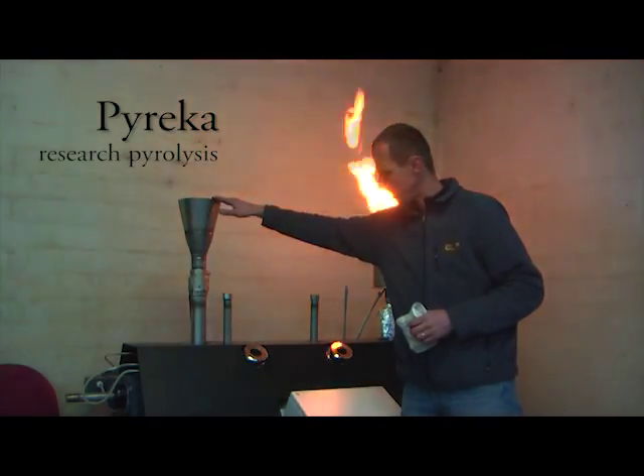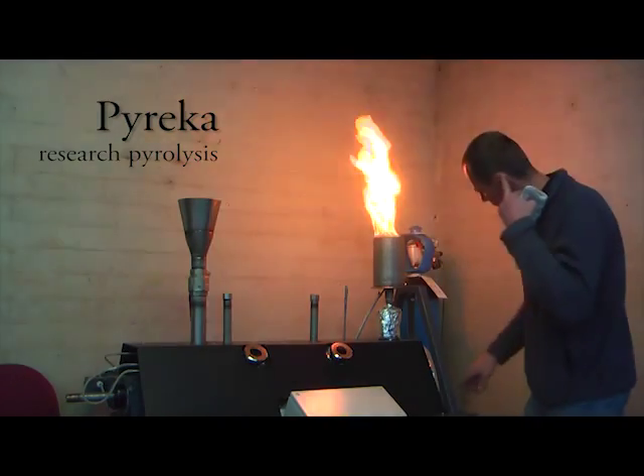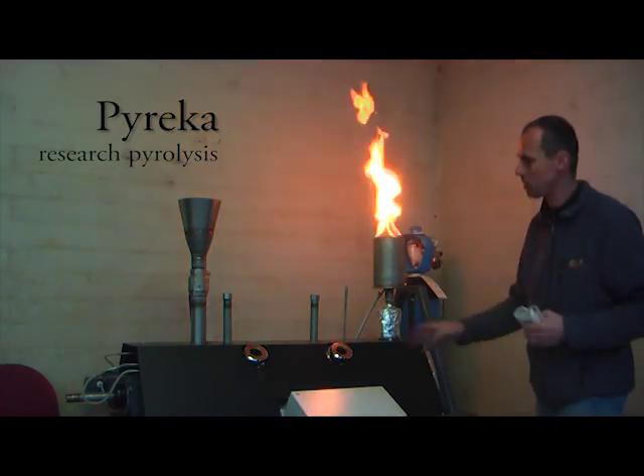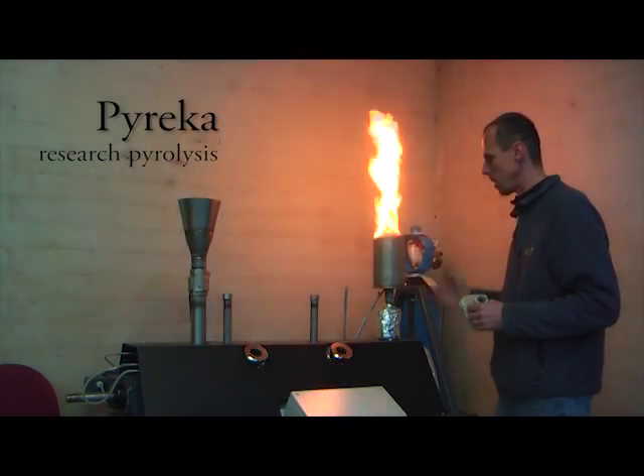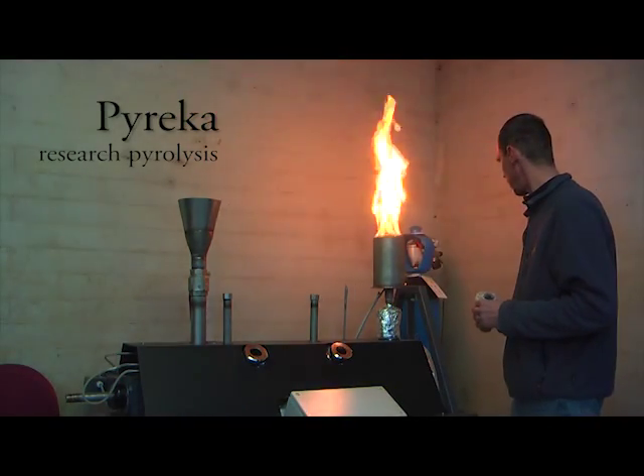The entrance of biomass is here and the exit here. The minimum residence time is seven minutes and we can increase it up to three hours residence time.